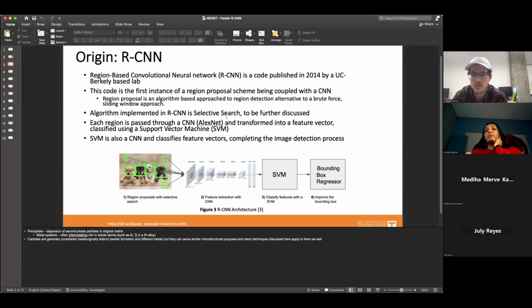The two horizontal lines that you see in your slide, I think this is written FCN, fully connected, right there. So the image is flattened, and now it goes under that neuron treatment, and it directly predicts the classes it has to predict. Then they are using another algorithm, that is SVM, when we have already predicted classes here.